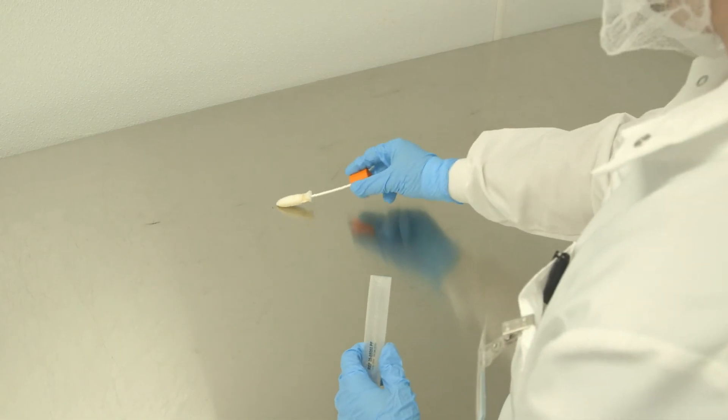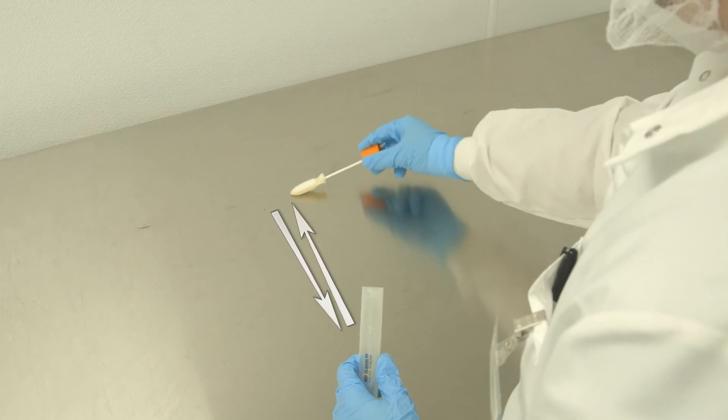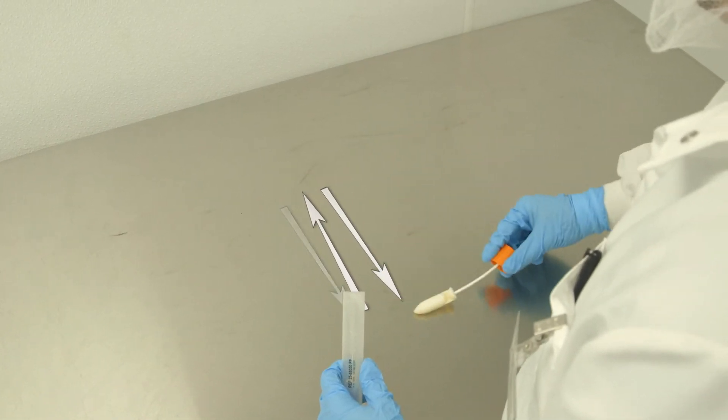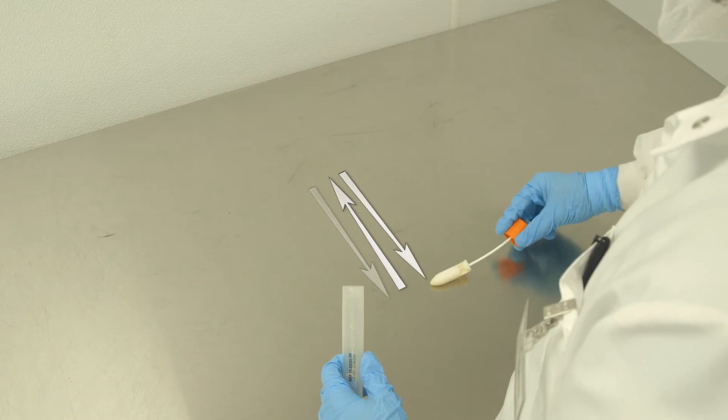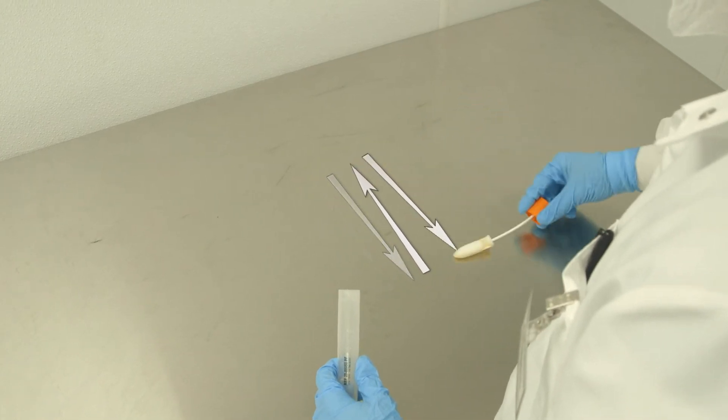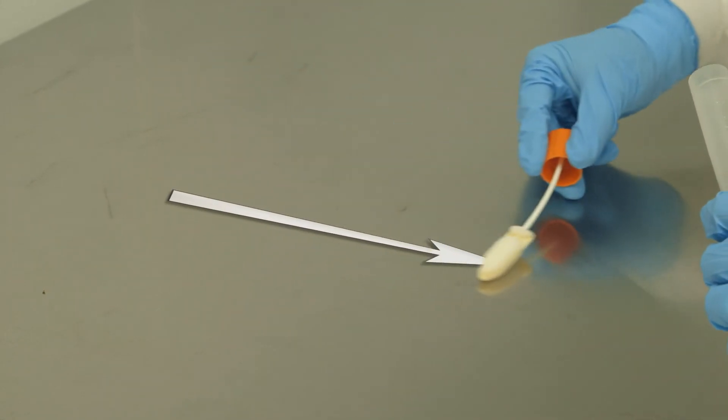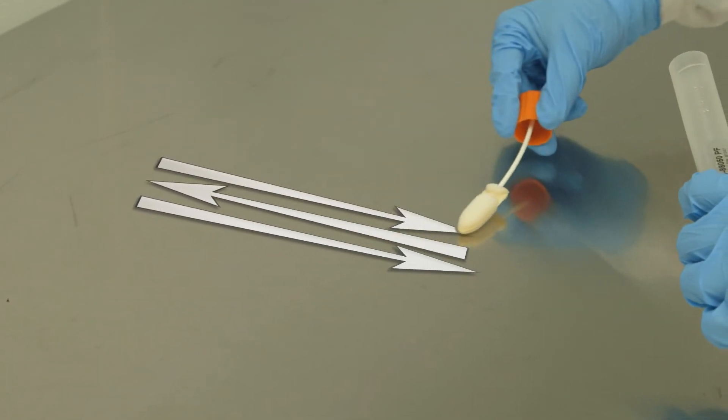Using one side of the swab, collect a sample in an area that is greater than or equal to 1 square foot by vigorously rubbing the swab with firm pressure approximately 10 times in a vertical up and down motion following a Z pattern.